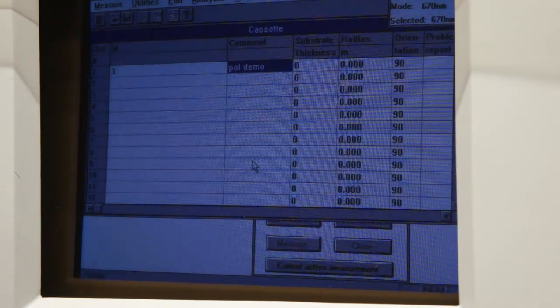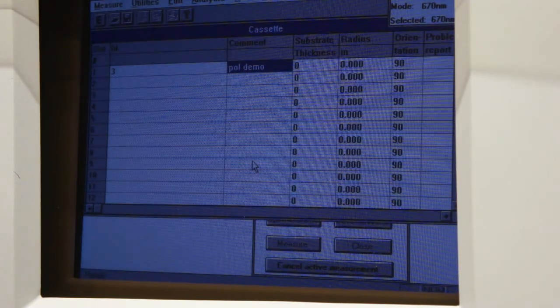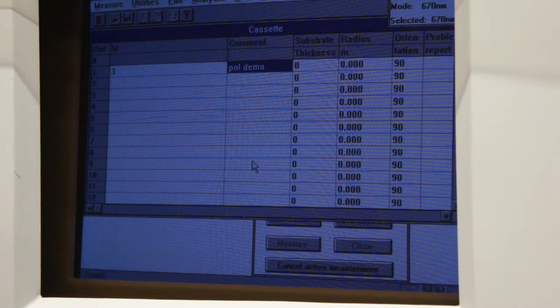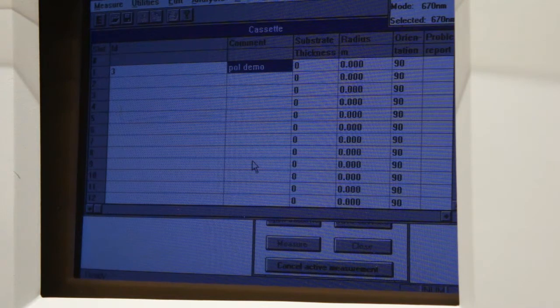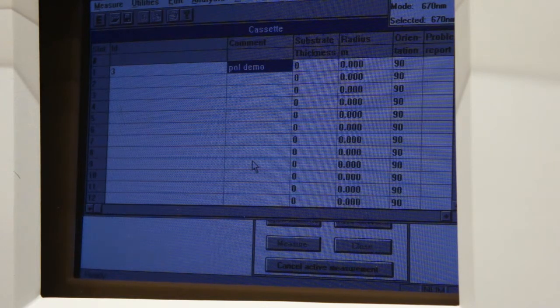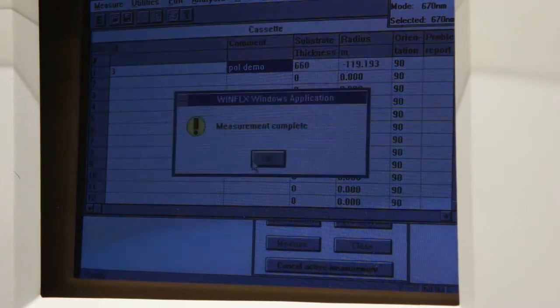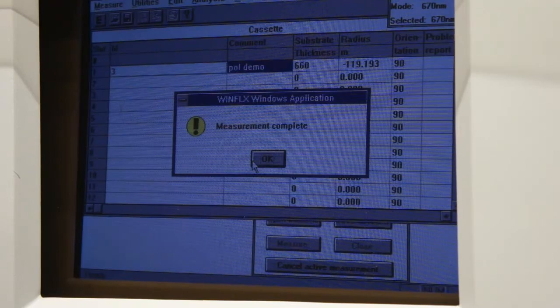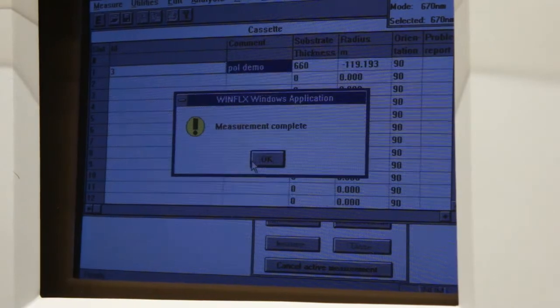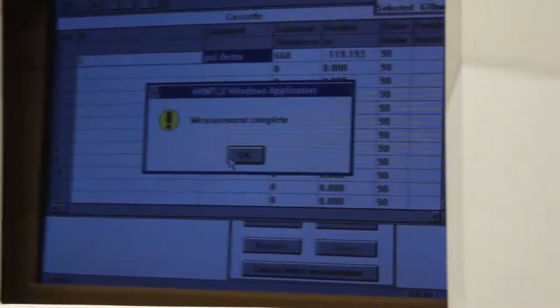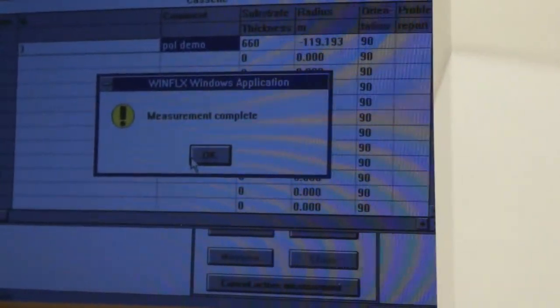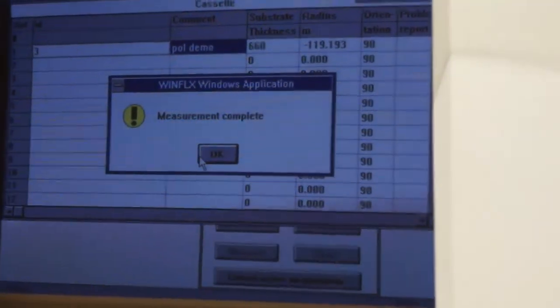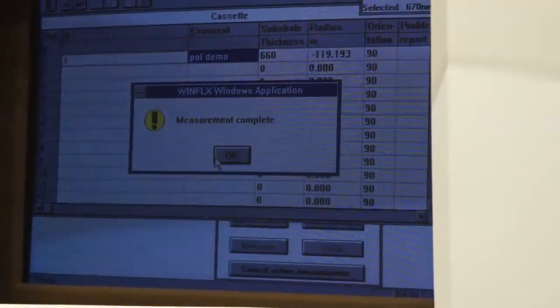So at this point we're looking at wafer A and substrate thickness, should be about 660 plus minus 1 micron and you can see right there that we are at 660.